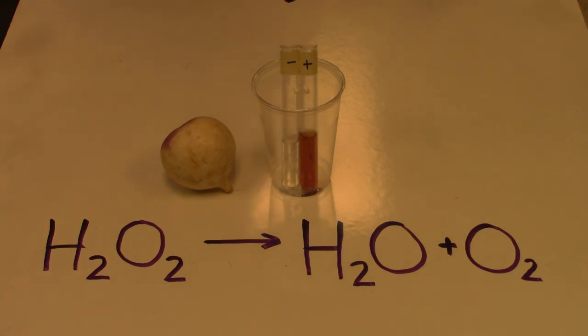Once you have your graph created, your last step is to go ahead and use that graph along with the background knowledge to go back to our driving question and explain how exactly did this enzyme affect the rate of this biological reaction.